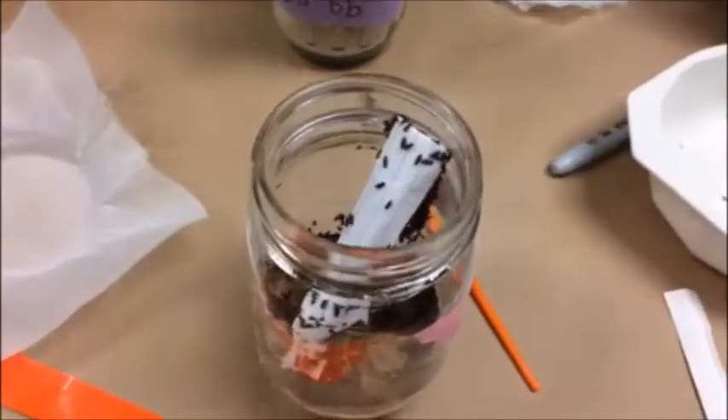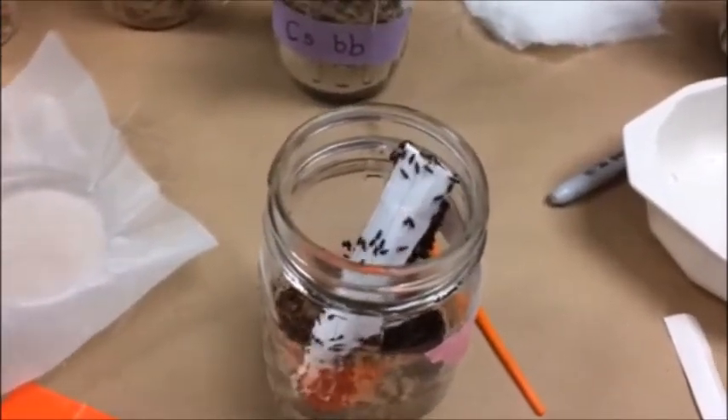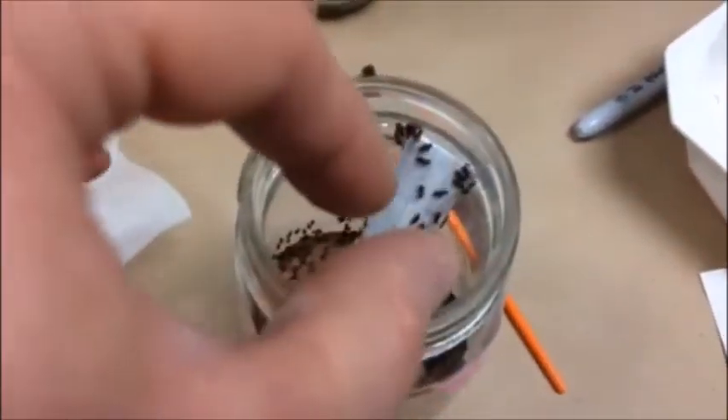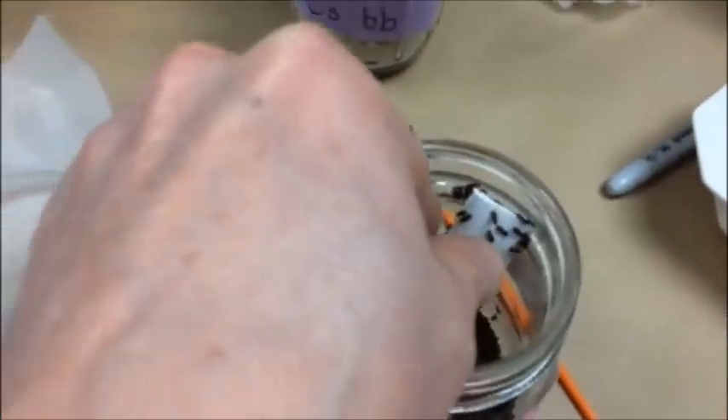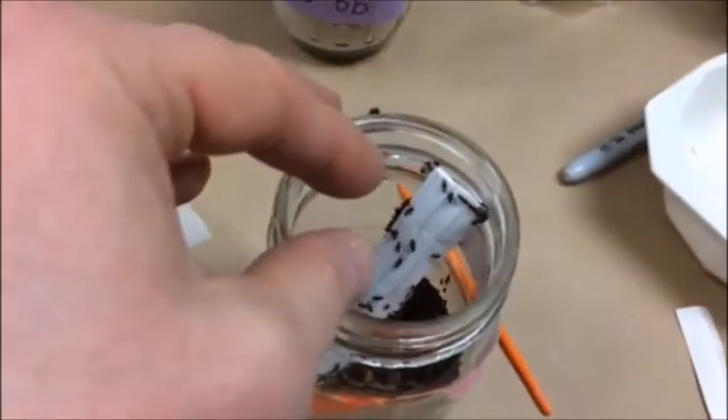Something I forgot to say at the end of this video: do not leave the piece of paper in the jar. And here we see the actual reason why — how are we going to get this paper out? If I reach in here to get it... now they're all over my hands. So don't do that. Leave the paper out and put the lid back on when you're done.